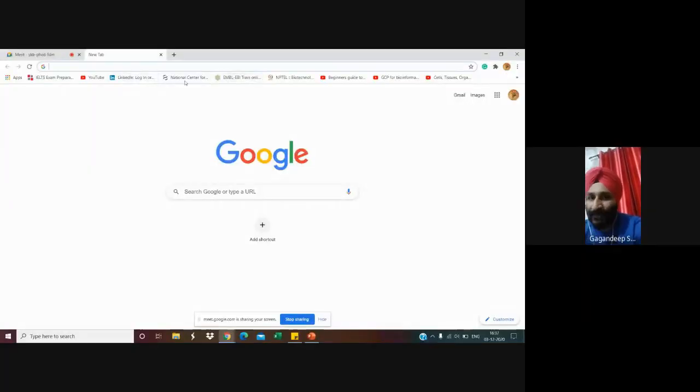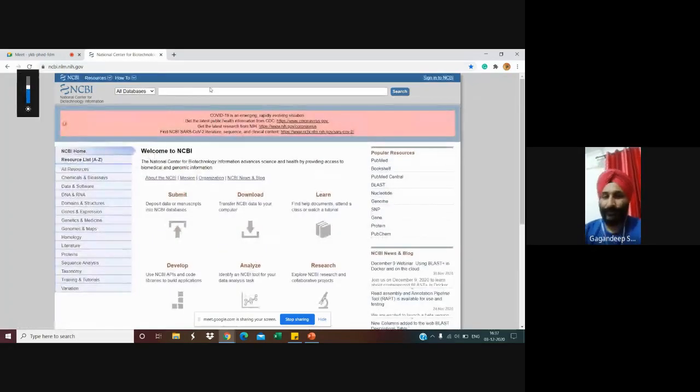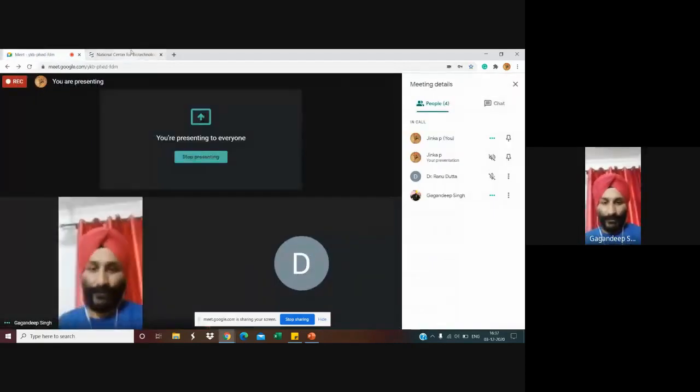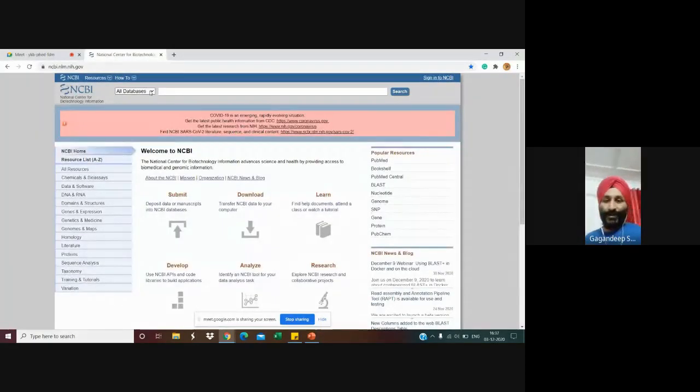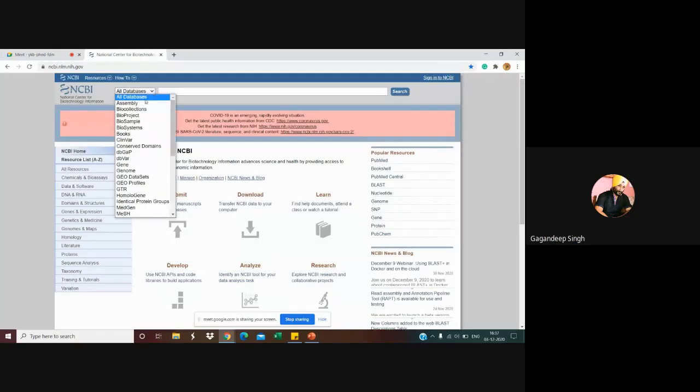Maybe Partha can share his screen. Partha, please share your screen. You can see my screen. Partha, your screen is visible. Yes, so this is the SRA you're talking about. Yes, this is SRA.